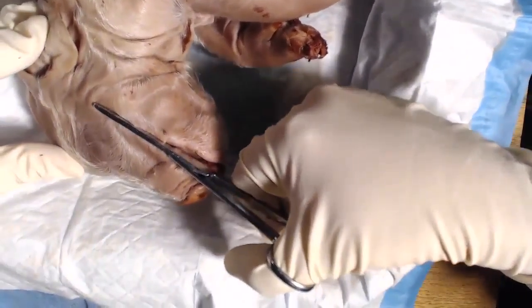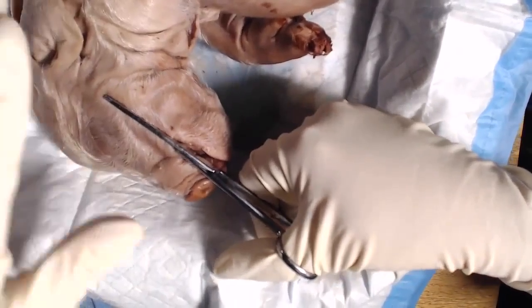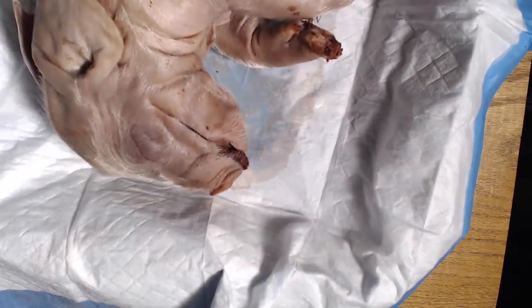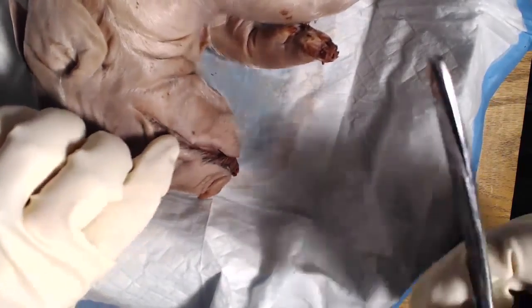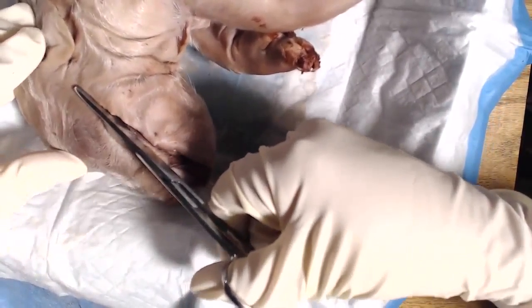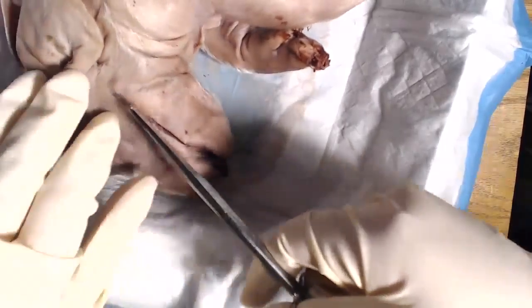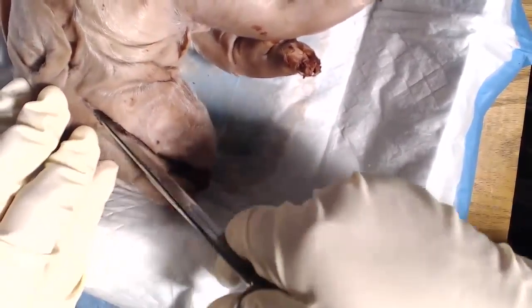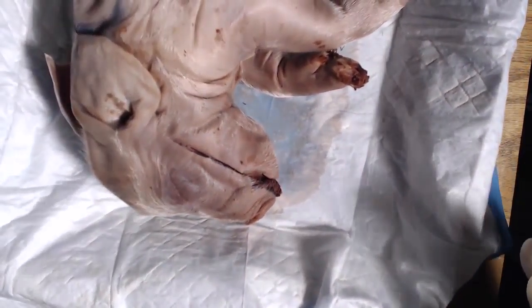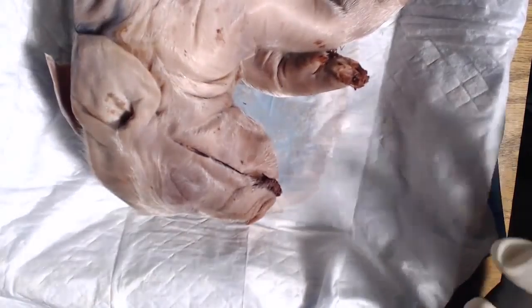All right, I feel like I'm underneath the bone and the muscle here, so I'm going to go ahead and make that hard cut. Okay, I'm just going to extend that cut a little bit more again towards the ear. We should be all the way through the bone at this point. I'll give you all a few minutes to do that. So you should have the same cut on both sides of the pig's face.